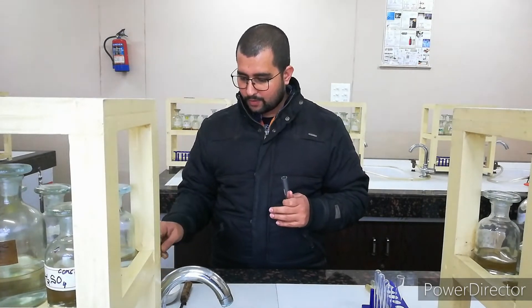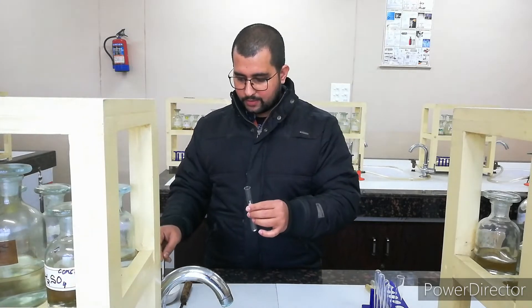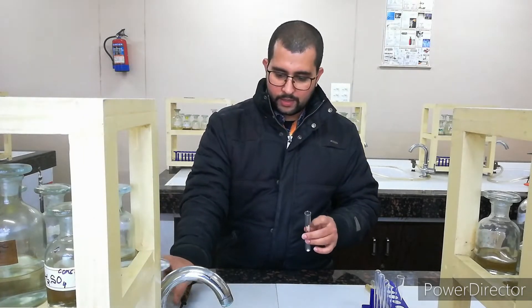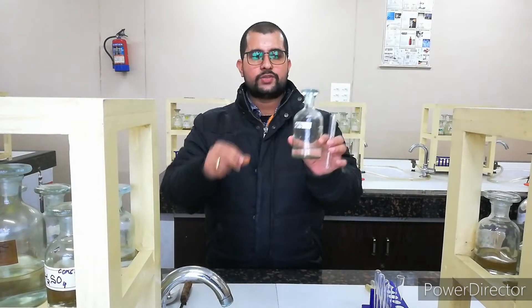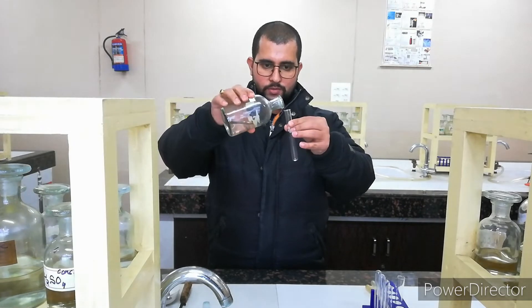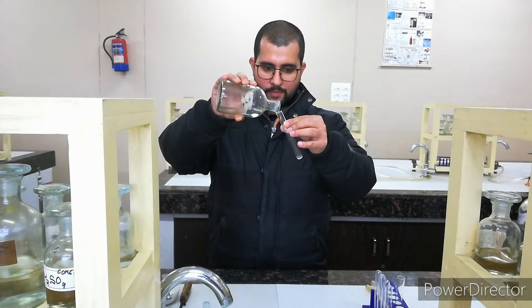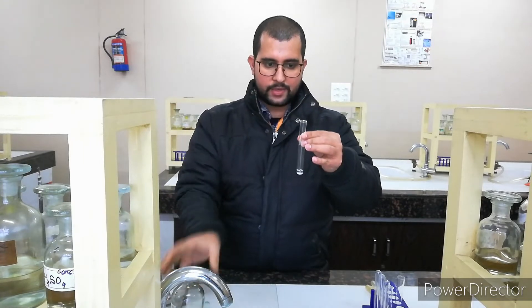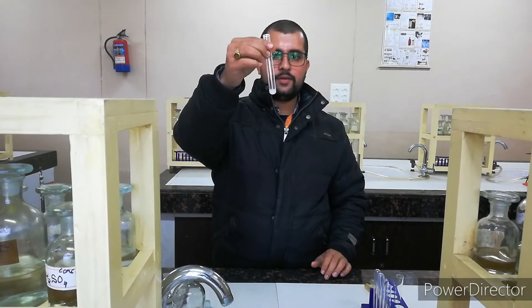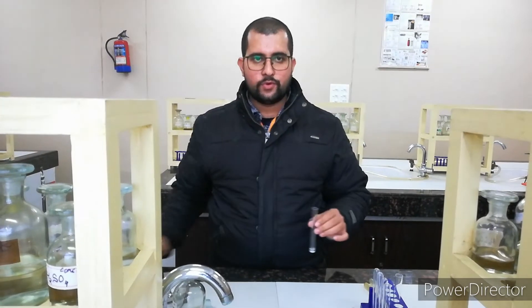I am taking this small sample with this spatula and adding dilute H₂SO₄ to see what will happen. This is your dilute H₂SO₄. I am adding it here little by little slowly and we can see nothing is happening inside. So we will move for the concentrated H₂SO₄.